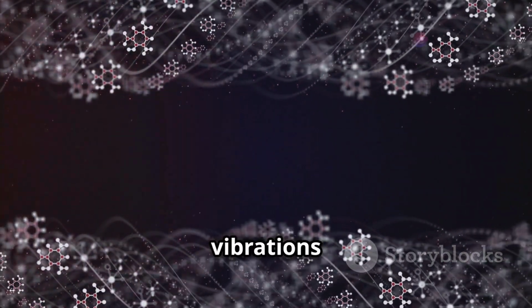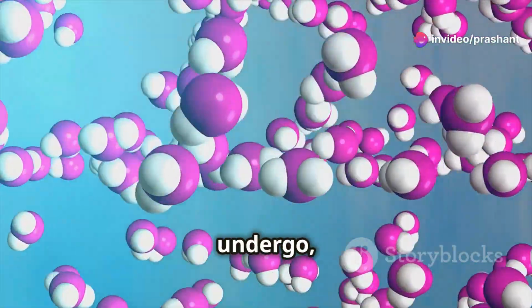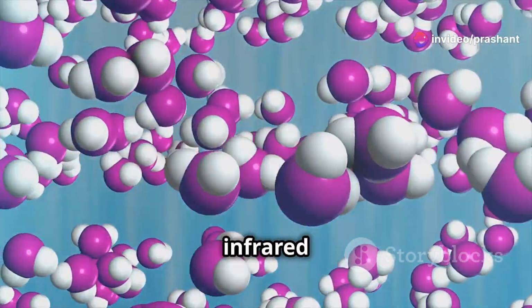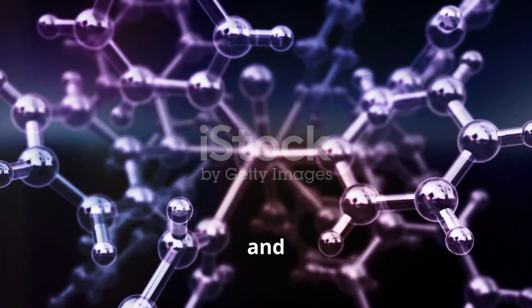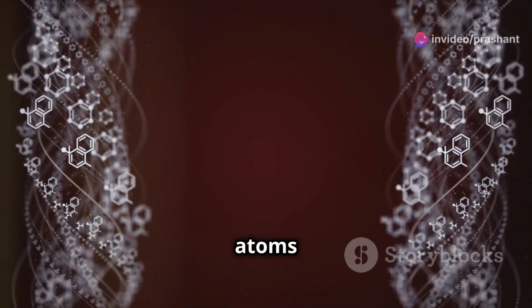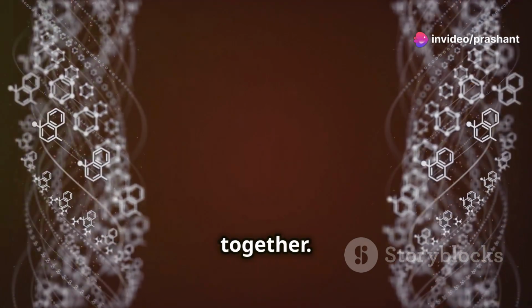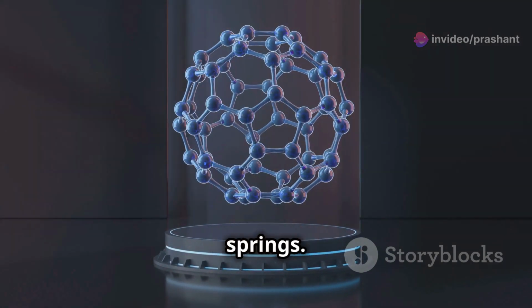Remember those molecular vibrations we talked about? Well, there are different types of vibrations that molecules can undergo, and each type absorbs infrared light at a specific frequency. The two main types are stretching and bending vibrations. Stretching is like pulling on a spring. The atoms move further apart and then closer together. Bending, on the other hand, is like changing the angle between two connected springs.